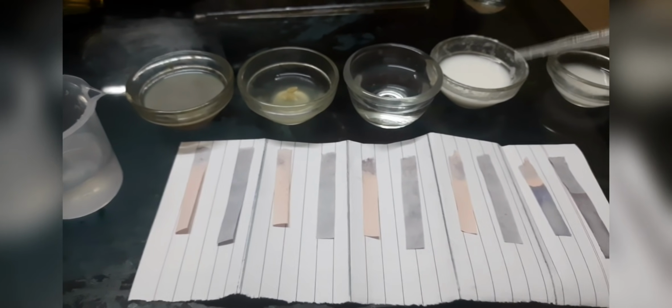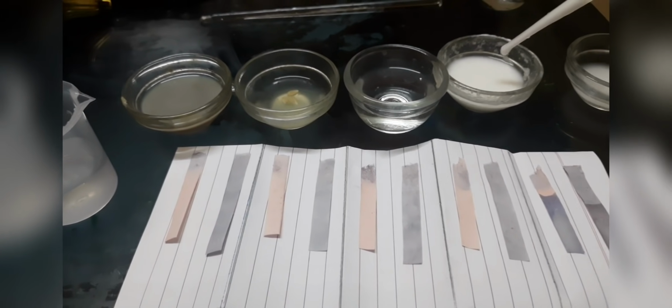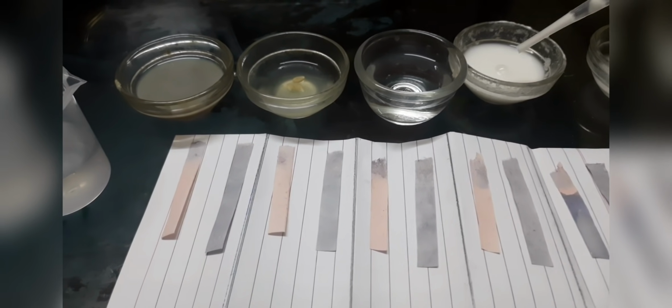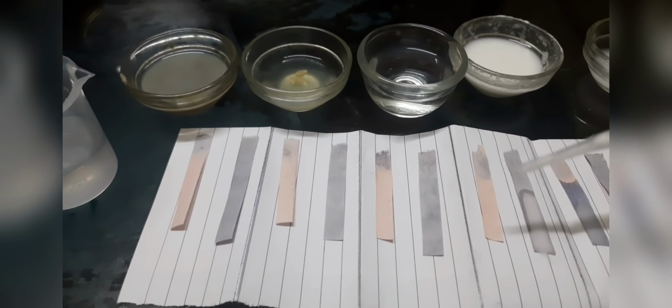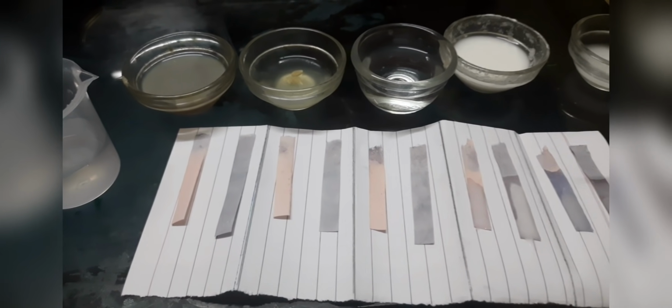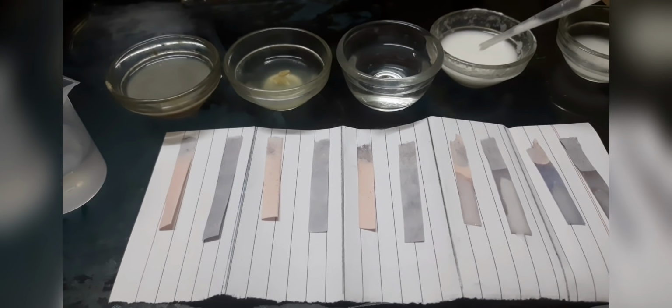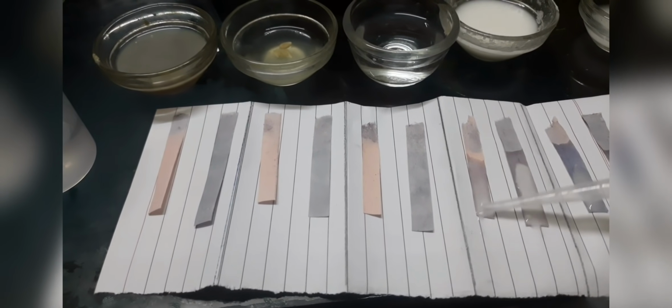Now I will start with the baking soda. Take some baking soda, a bit. Try it on the blue litmus. Try it on the red litmus. You can see the color is changing over here and over here. Now wash the dropper again.